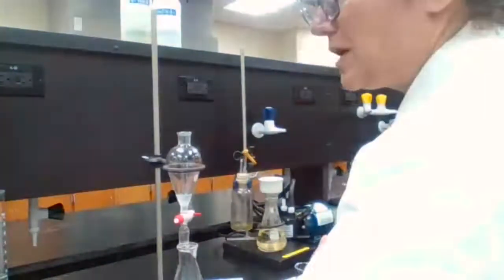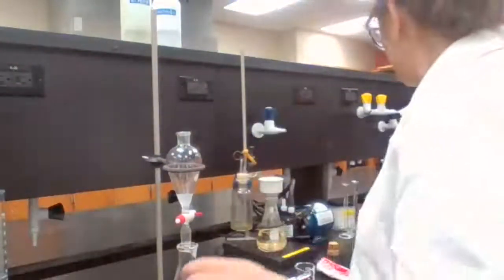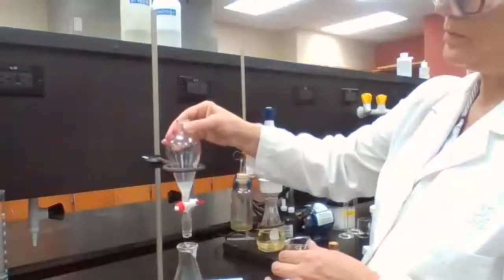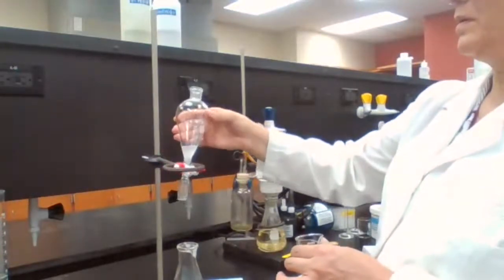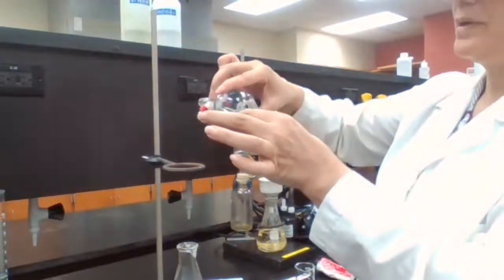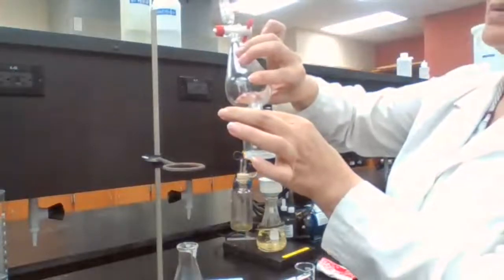I transfer the top layer into a beaker. Going to transfer from the top to a dry beaker. You want to make sure the beaker is dry.